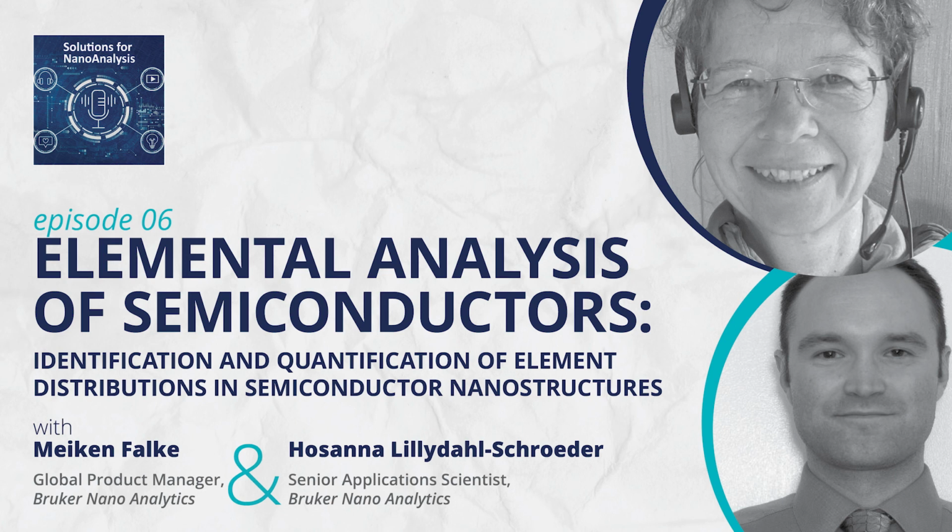How they behave with electrical current, electromigration is a word. So biased specimens in SEM and TEM can be looked at, or what is mechanical load causing. So this is the whole bunch of in situ experiments, which is booming at the moment and of high interest because we now can analyze so fast.